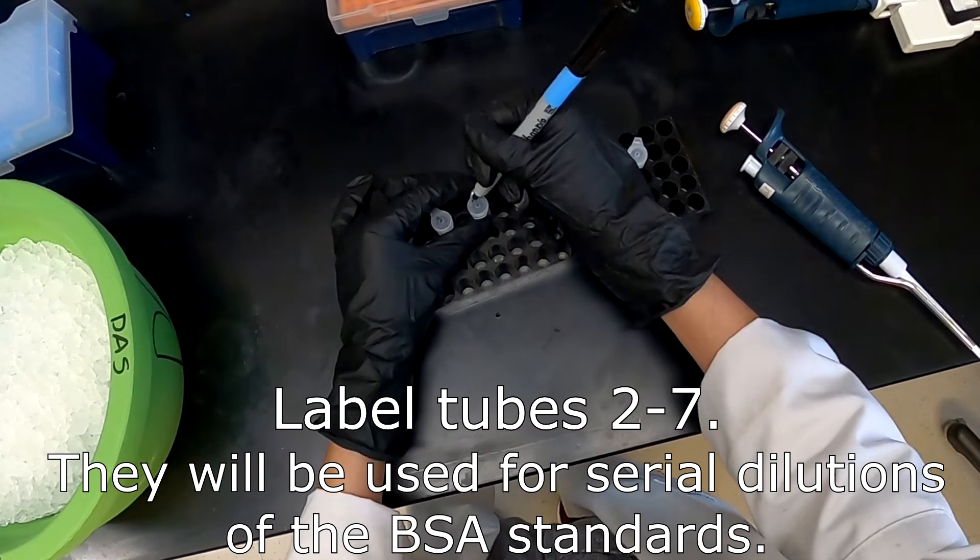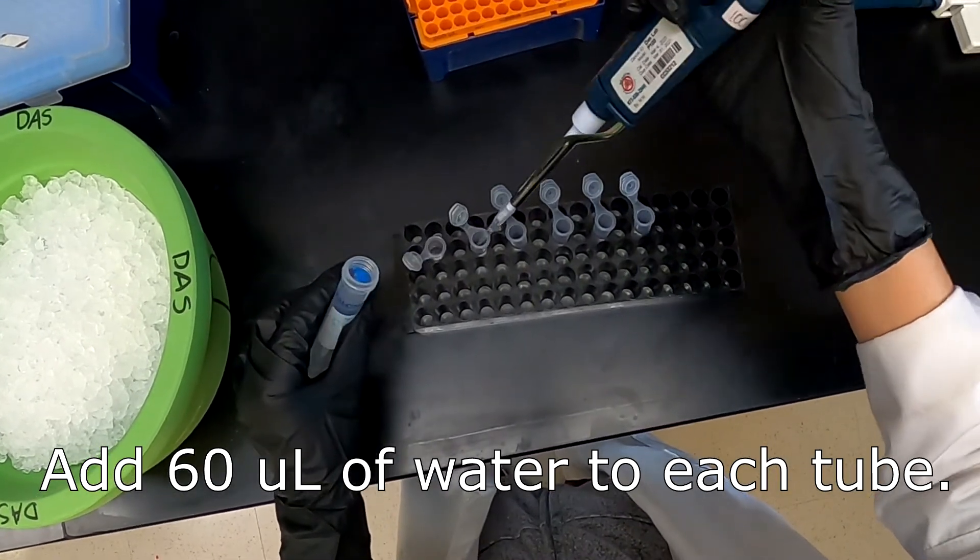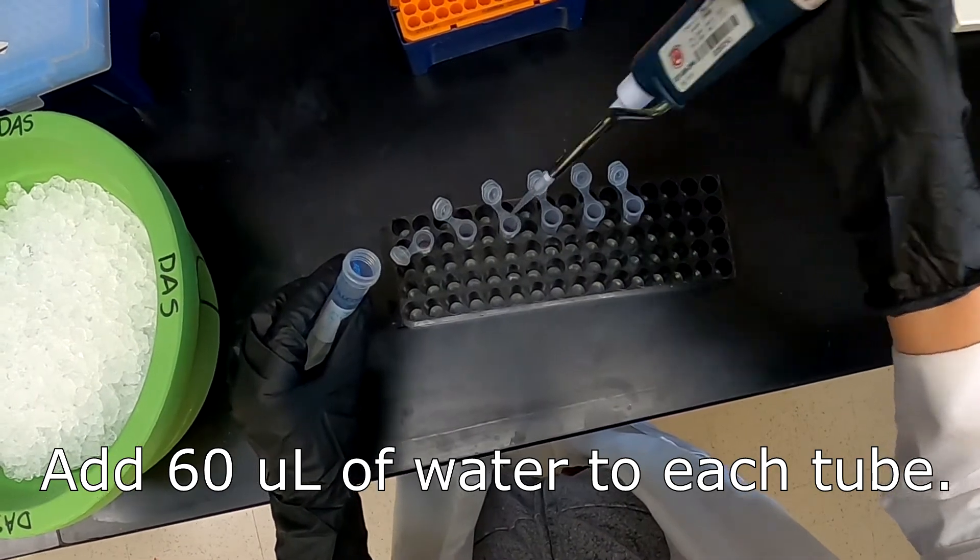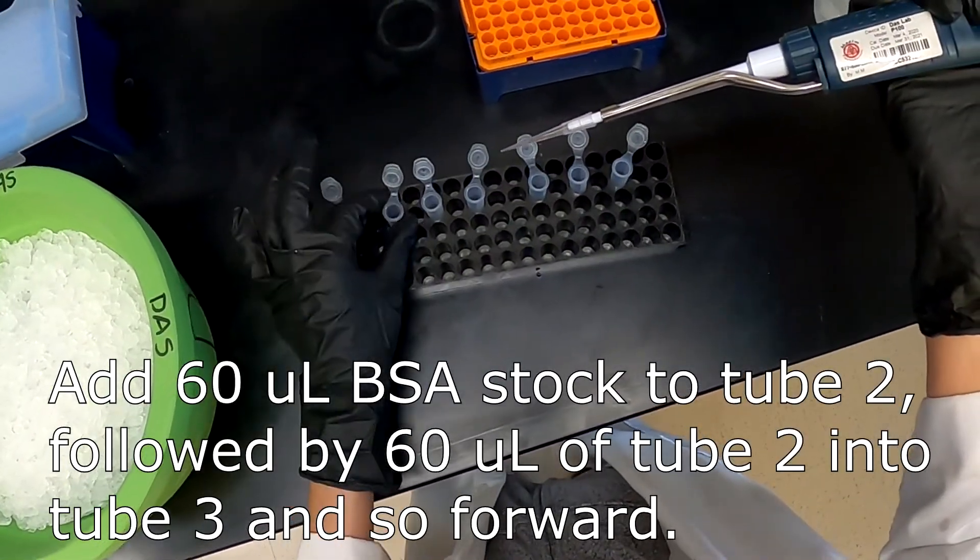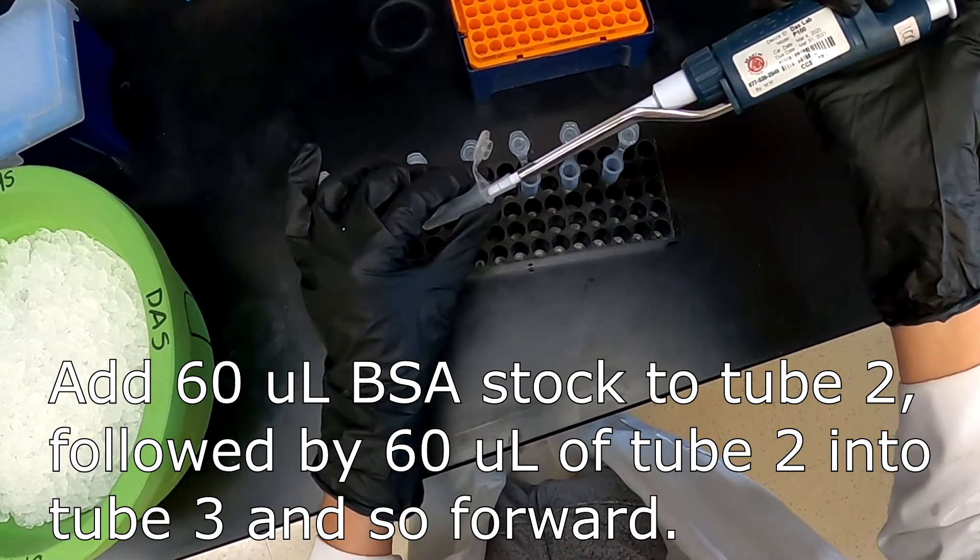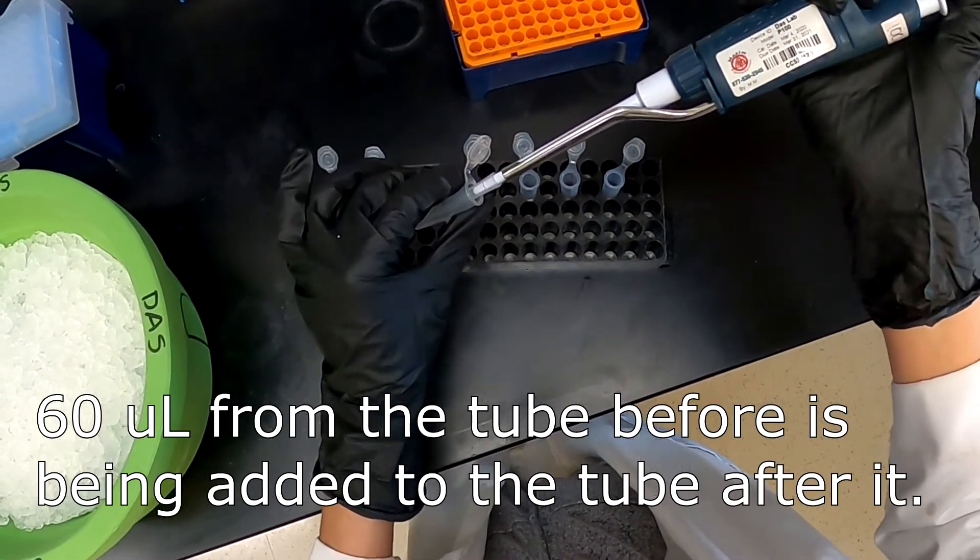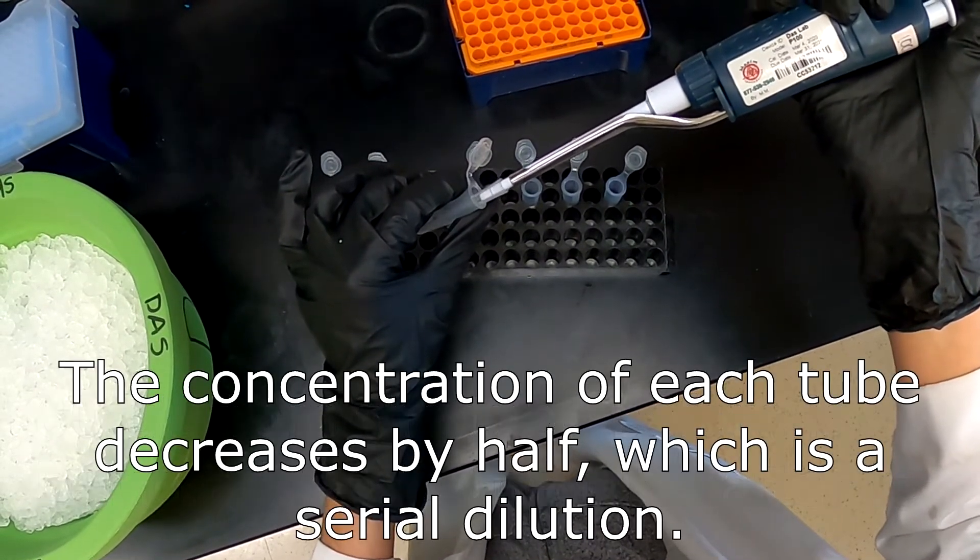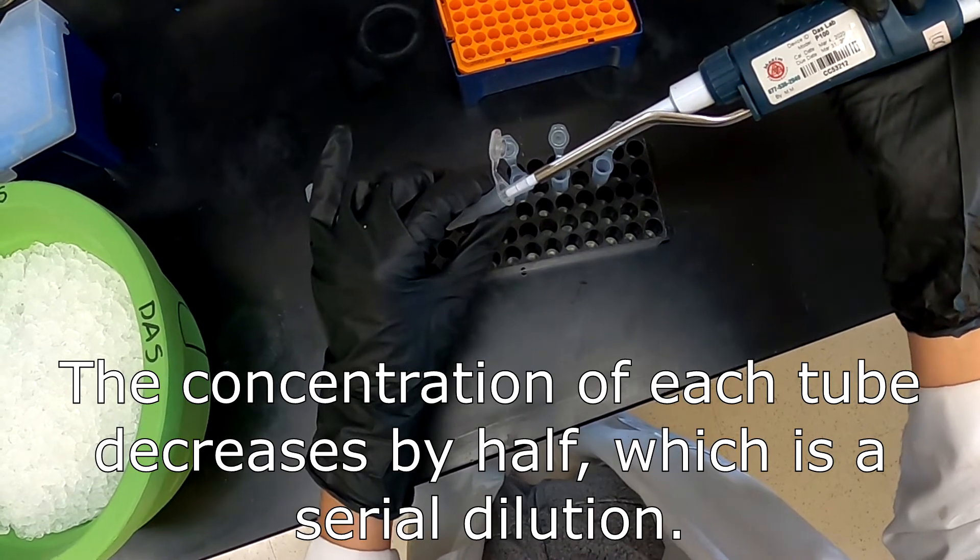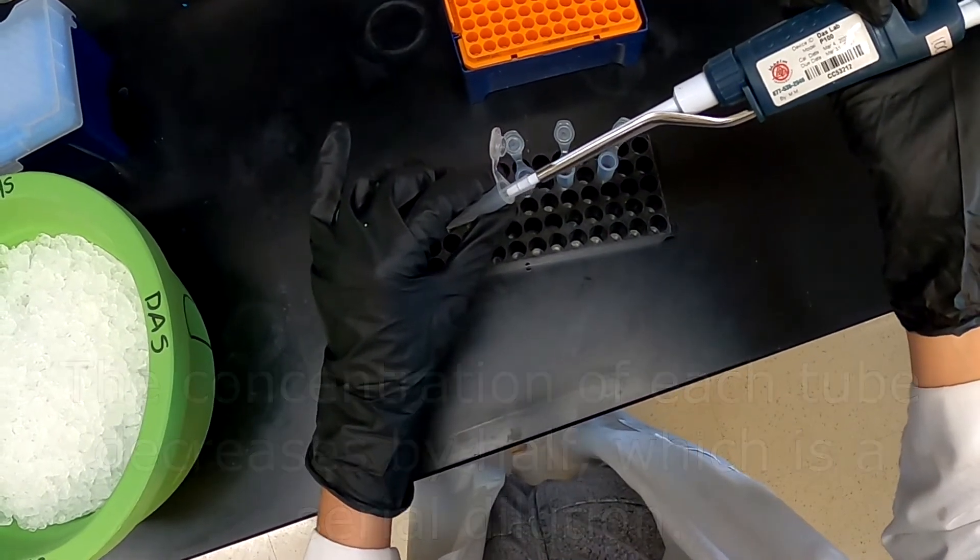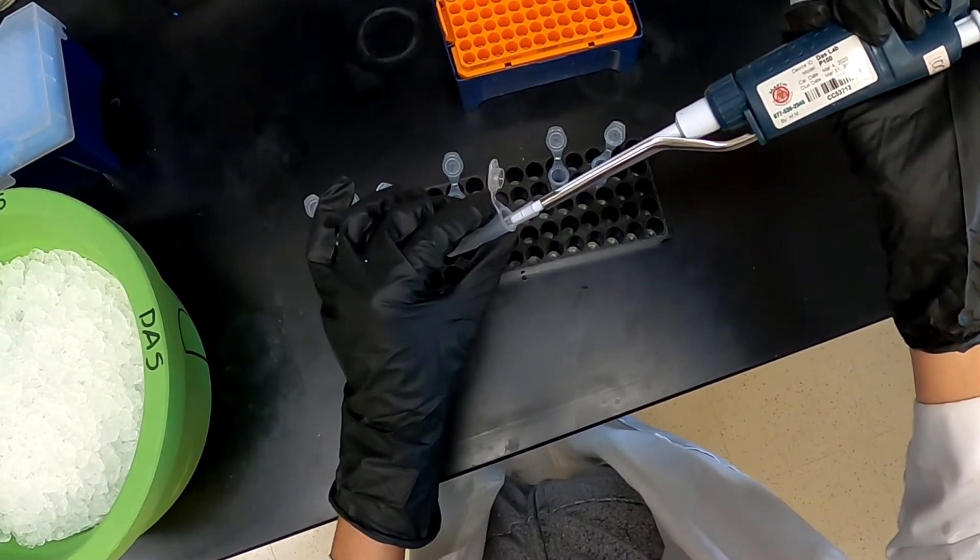In order to start this experiment, we will first start by making our BSA standards, or bovine serum albumin. We will then place 60 microliters of water into tubes labeled 2 through 7. Then we will place 60 microliters of our BSA stock into tube number 2, followed by taking another 60 microliters from tube 2 into tube 3, followed by another 60 microliters from 3 to 4, and so on. This is referred to as a serial dilution, and each tube will have its concentration of BSA lowered by half. So we will end up with concentrations of our BSA standards as 2000, 1000, 500, 250, 125, 62.5, and 31.25 micrograms per ml.